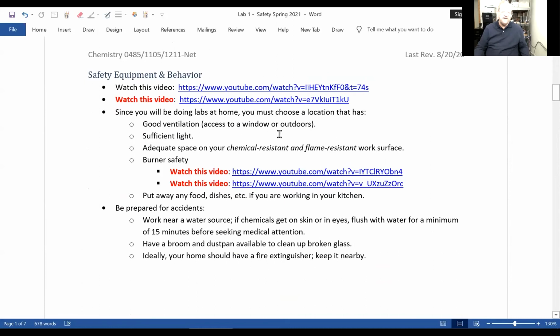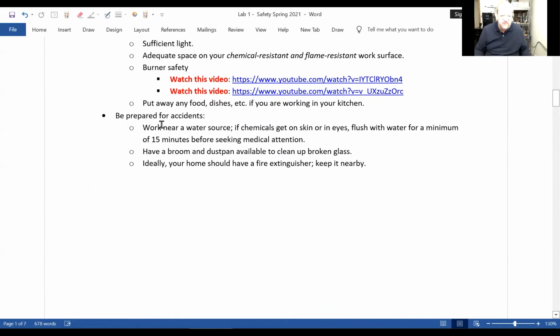Now, here's some more videos if you want to watch. You don't have to, on safety. We're not using a Bunsen burner at home, safety equipment. But this is important: if you ever get anything on yourself, chemicals, you should always use water to get rid of it. If you ever get chemicals in your eyes, wash it, flush it. At COD, we have eye wash fountains. And yes, unfortunately, I've had to use it with students because they didn't follow my directions.